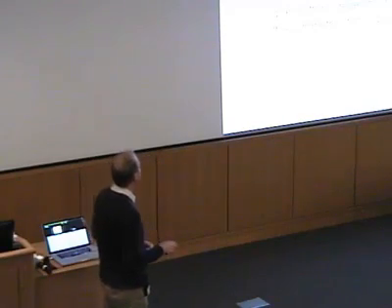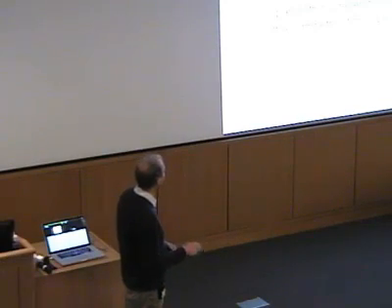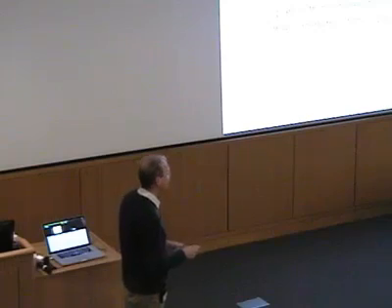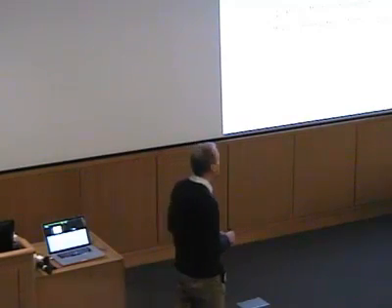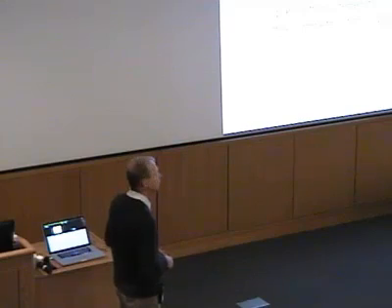But as a general rule, then, I can distinguish radicals relatively easily from metal ions in an EPR experiment because the radicals will all be appearing near the free electron value, and the transition metals will typically have broader spectra and be shifted away to a larger extent from the free electron value.